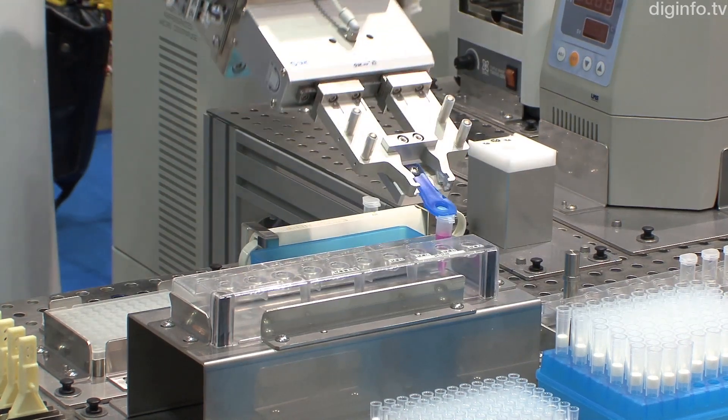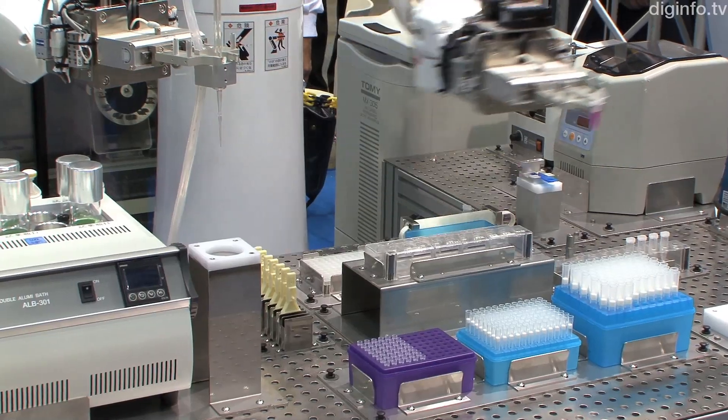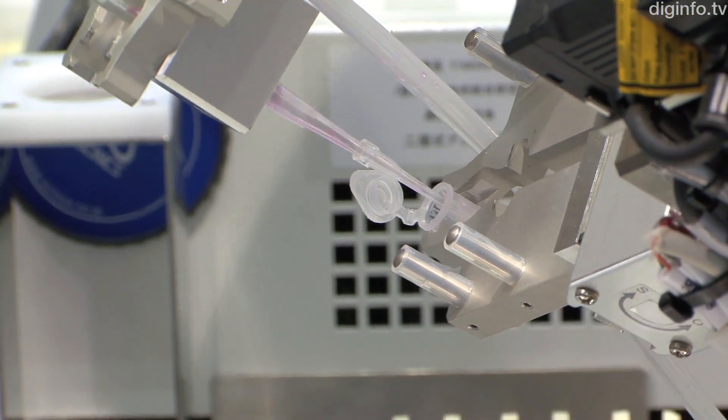Previously, to teach a robot with this many joints, a huge amount of programming was required. But Mahoro can be taught easily in a virtual space on a computer.